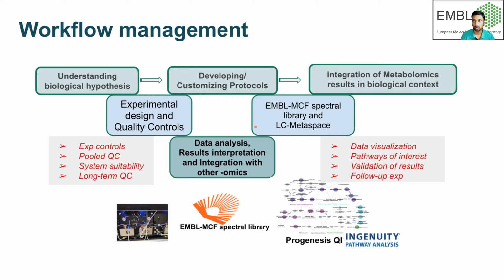And you should have your own spectral library or your own database, or you should have your homework done before going for identification, because you can't rely solely on a spectral library or unvalidated data. So you need to validate your own data with quality control as well as the spectral library. So these are two important pillars if you want to develop a good solid metabolomics work in your lab. Also, having your own data analysis pipeline and interpretation tools, and working with biologists, is also very helpful.